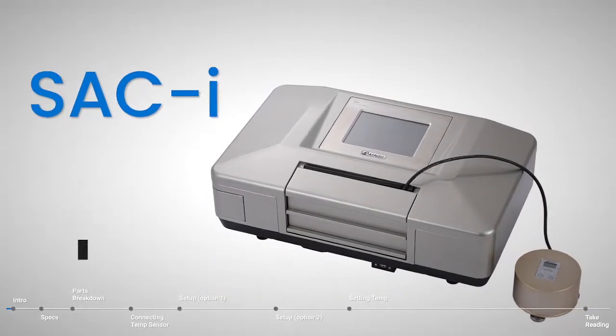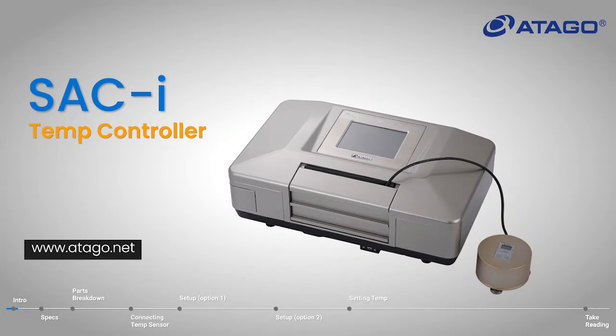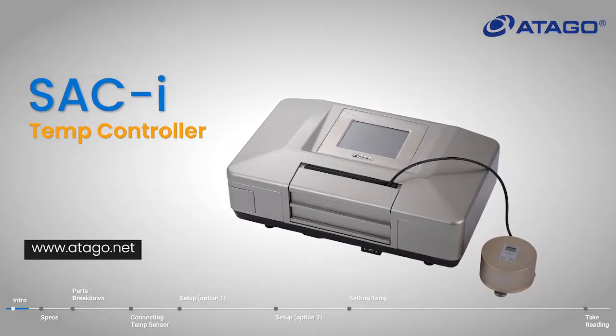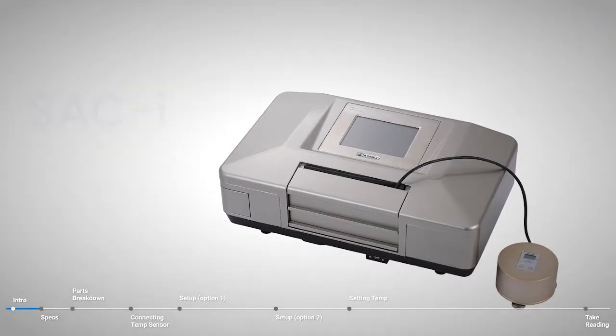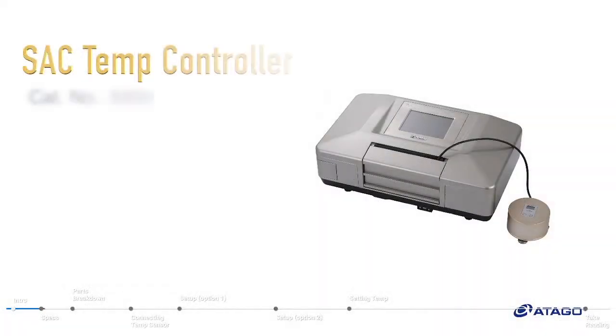Okay, so here you have the SAC-i, and as you can see, the body is just the usual SAC-i, but it has that temperature control unit that's connected to the flow cell that's inside. So that was part of the design. We wanted to fit the polarimeter you already have.